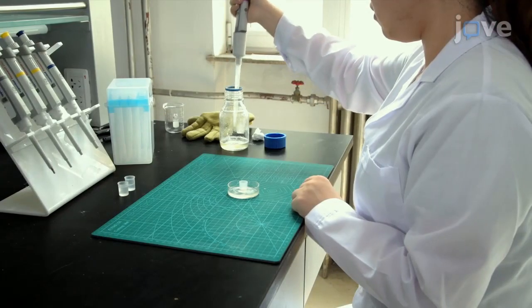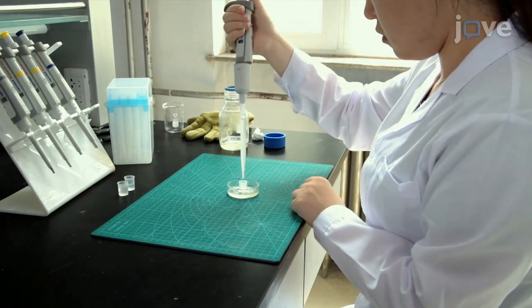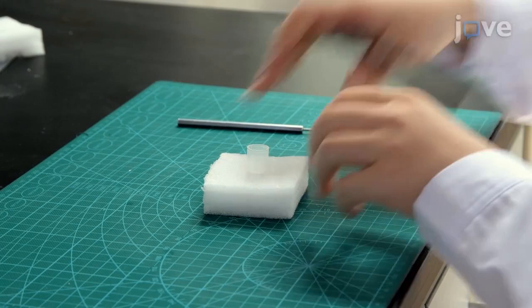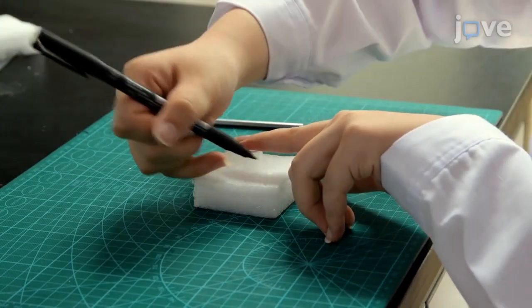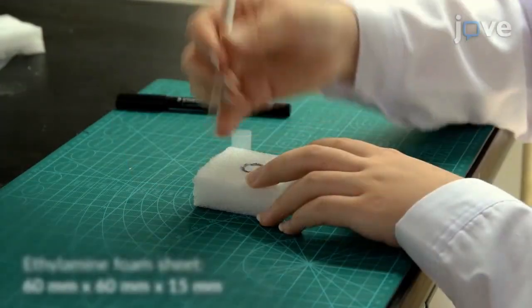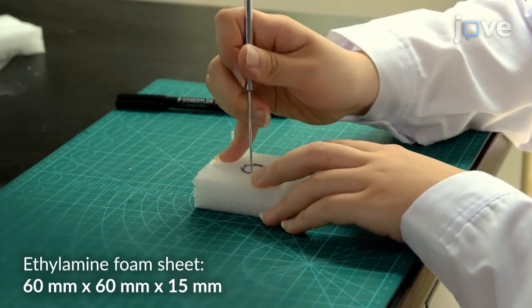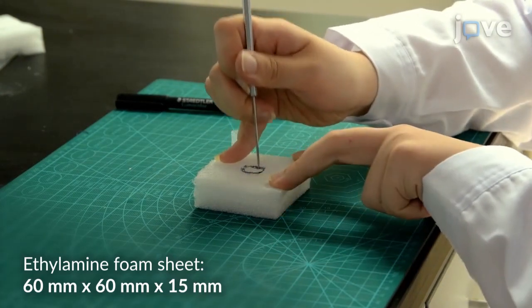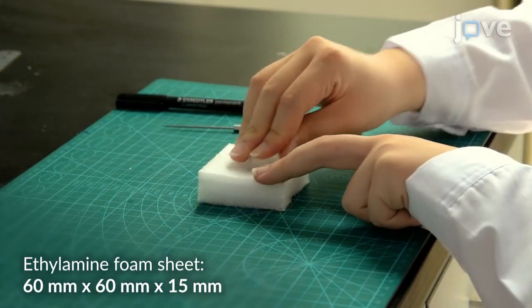Then, pour the agar gel into the FBOC to the desired thickness. Make an FBOC base by boring a 10 mm deep hole in the center of a piece of ethylamine foam sheet with the same diameter as the FBOC. Insert the FBOC into the hole.